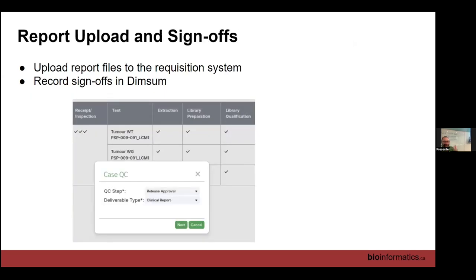Finally, having done our QC and written our report, we need to upload it to the system to get it into the next step of the process, which is sign-off by the clinical geneticist. We do this using the DimSum system. We click a link and get a pop-up dialog box — logged in, it knows who I am. I click 'approved' and it puts my name into the database, recording that I'm approving this report at this time. It then emails the clinical geneticists to take up the next step.